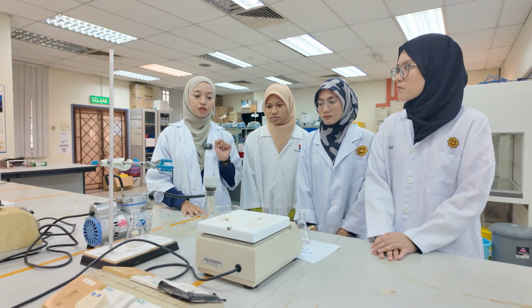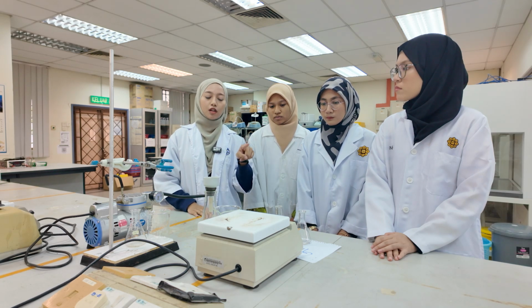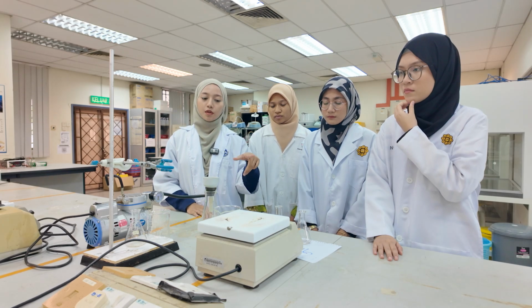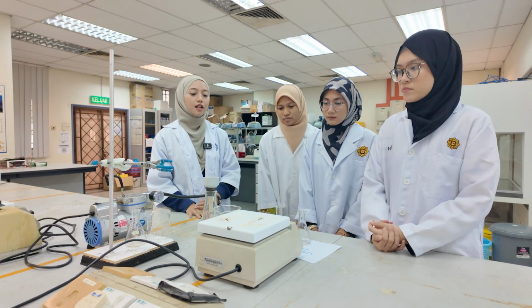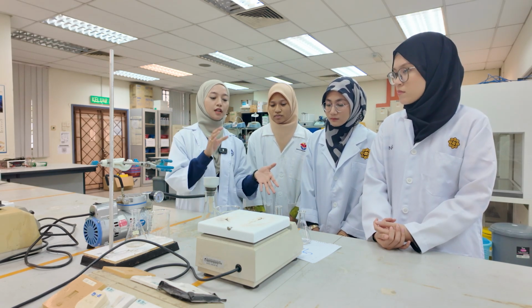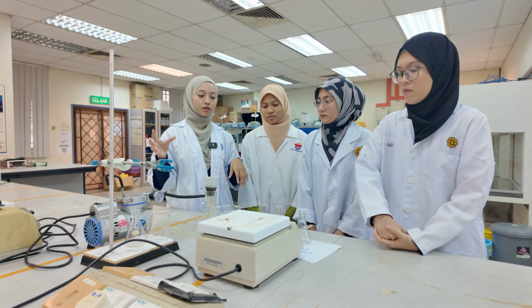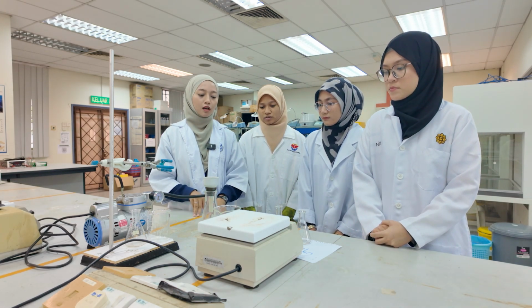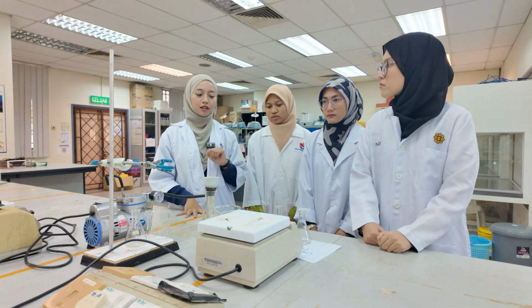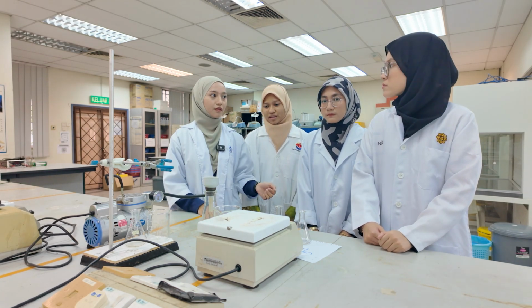Next, when we handle the hot plate, we must not touch it when it is currently being used, because we might hurt ourselves. And last, the crystals and also the solvents that we have used, we need to dispose of in the correct waste disposal, because if we just throw them in the sink, we might cause the release of vapor into the surroundings.